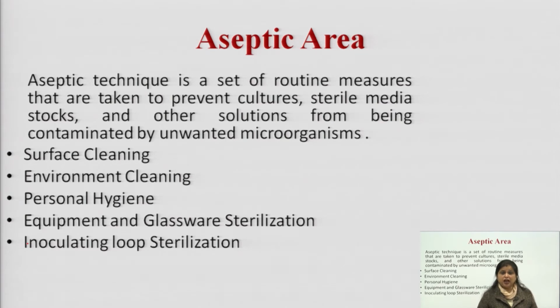Aseptic conditions, we have to follow hygienic conditions, we have to disinfect our surfaces wherever we are going to work. Those surfaces must be clean, and those surfaces are always cleaned with the help of various disinfectants. How can we clean the environment in which we are going to work? That must be free from dust particles, that must be free from microorganisms. How can we clean that environment?